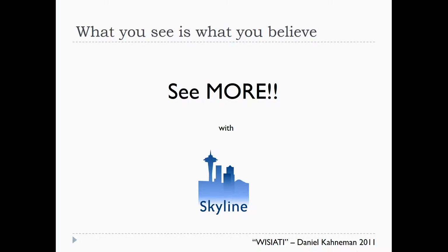And so even if you use whatever tool you use, this is still an incredibly useful data debugging tool. For that alone, you should gain mastery of it. That's what gets me the most excited about what I do: trying to figure out, when I learn something about the data, how can I make that obvious to everybody?